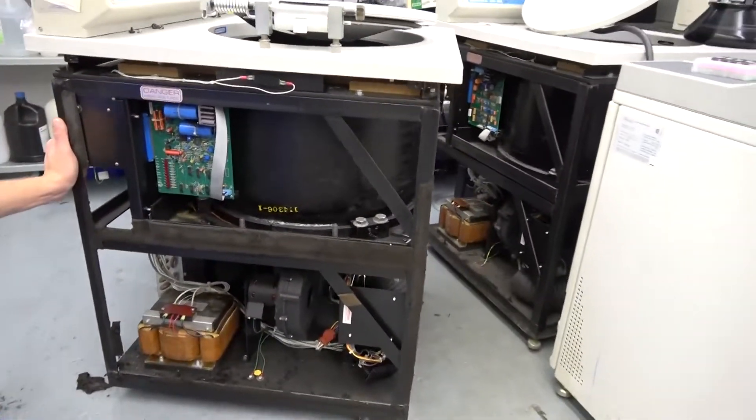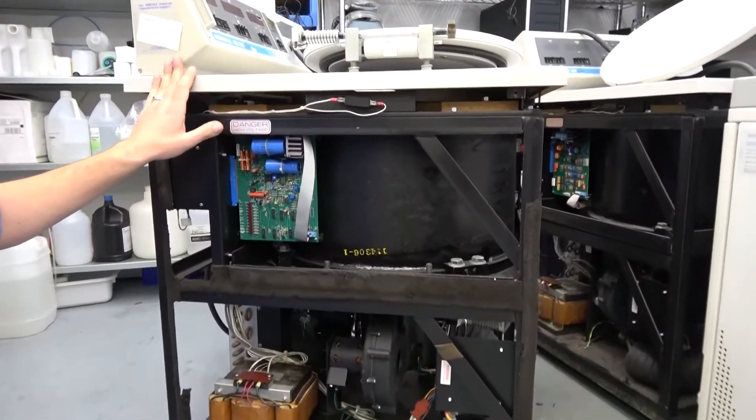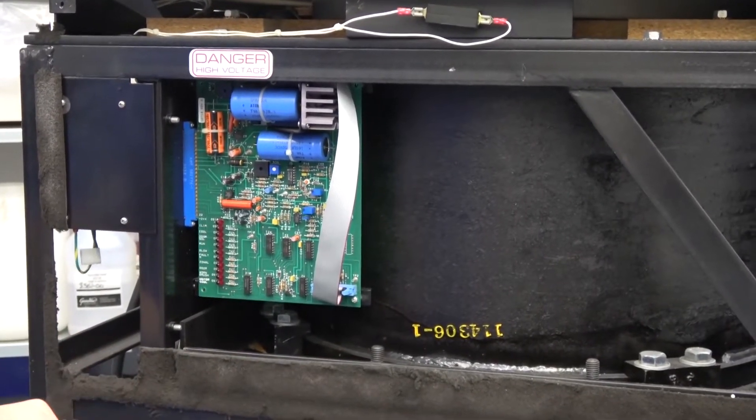Also not much on this side, but you do have your high voltage interface. Everything from your microcomputer board up at the top comes to here, and then this is what powers your motor and any of the high voltage assemblies.